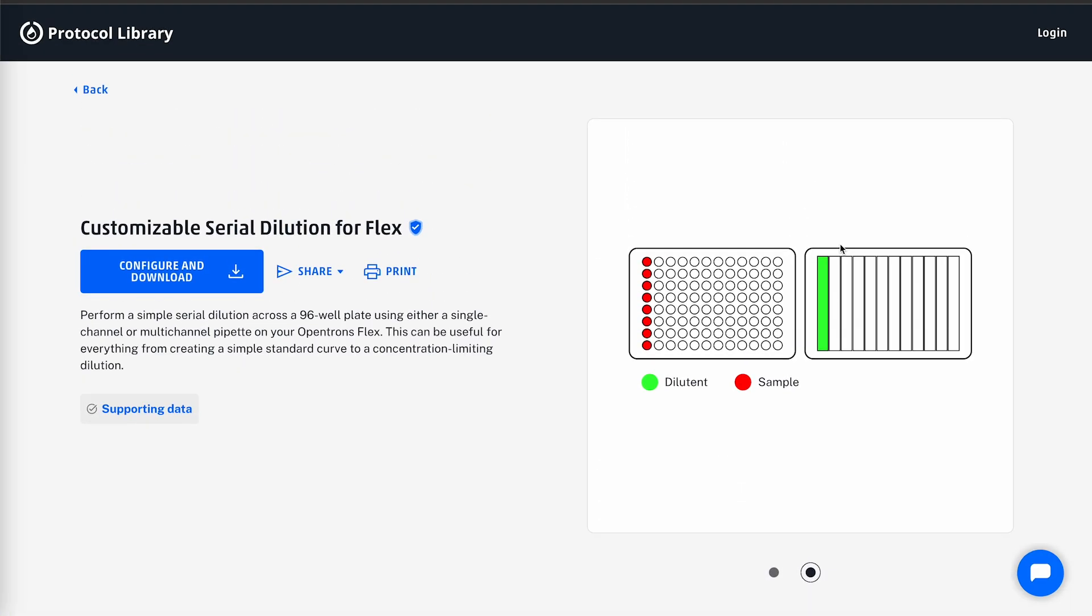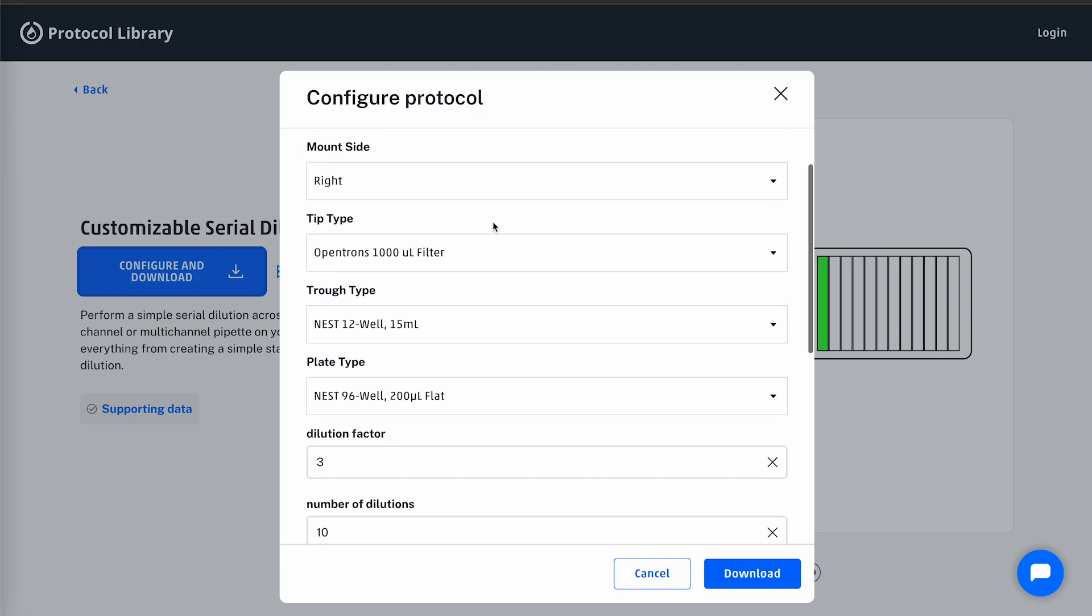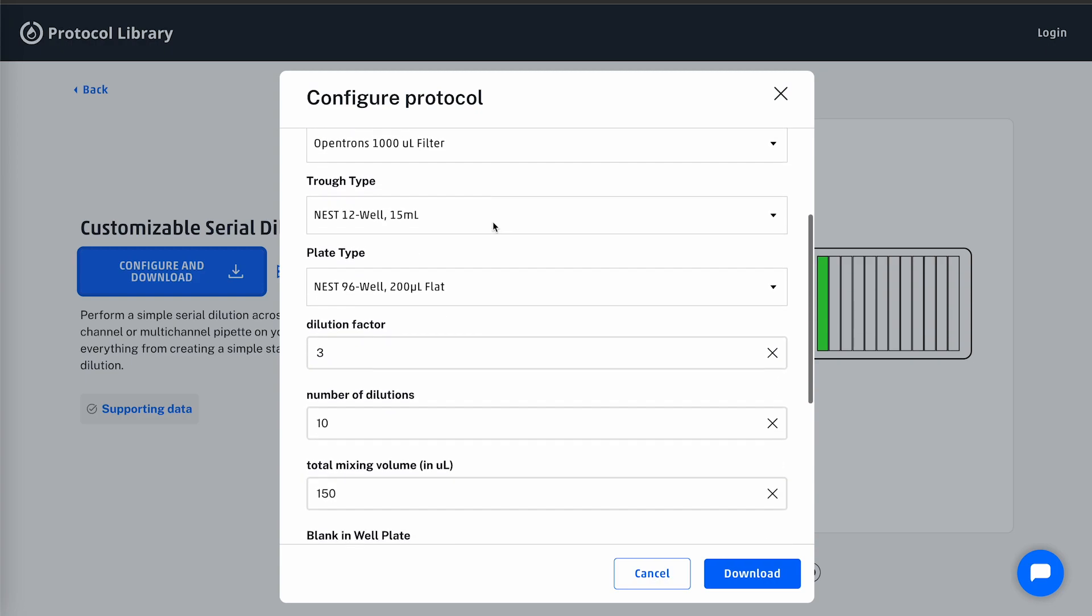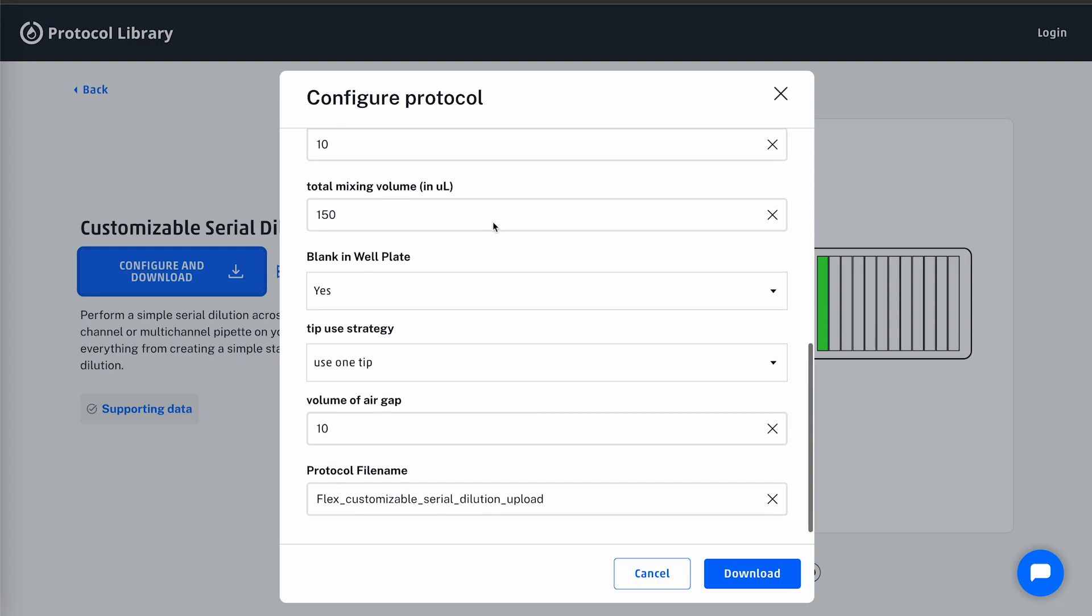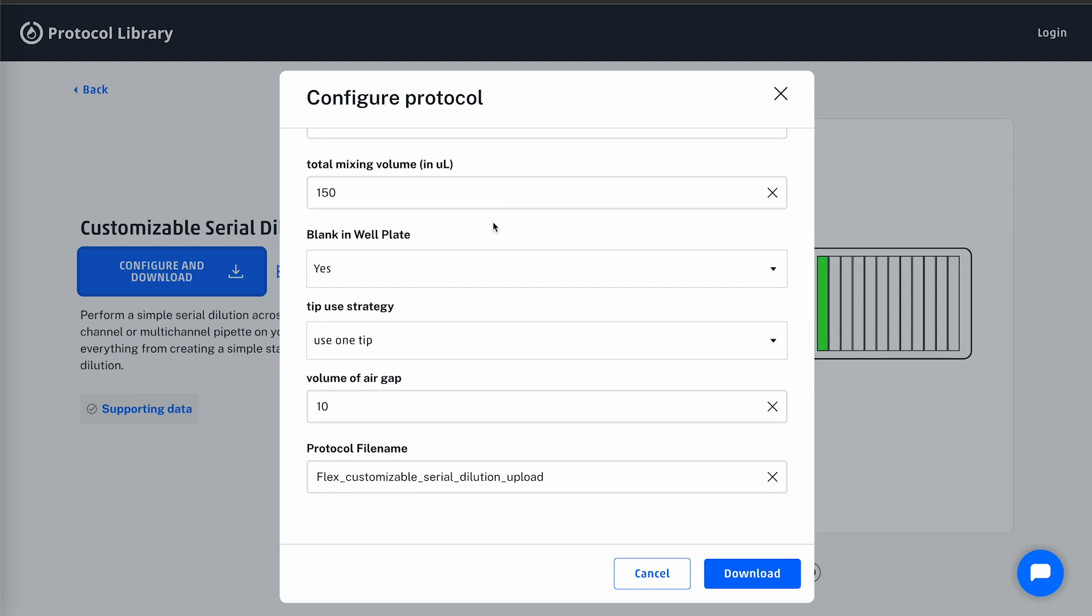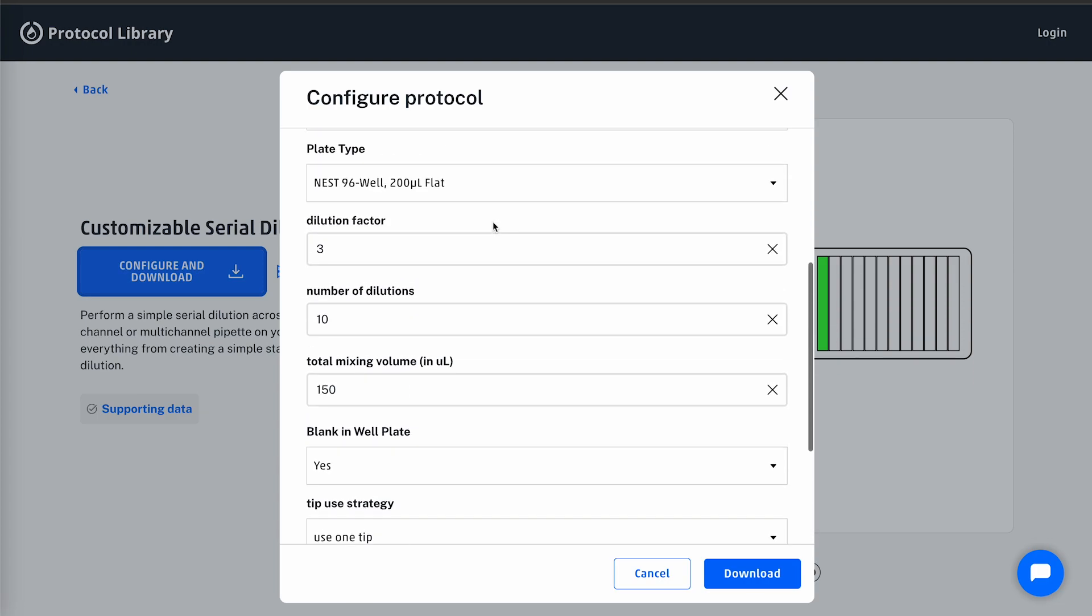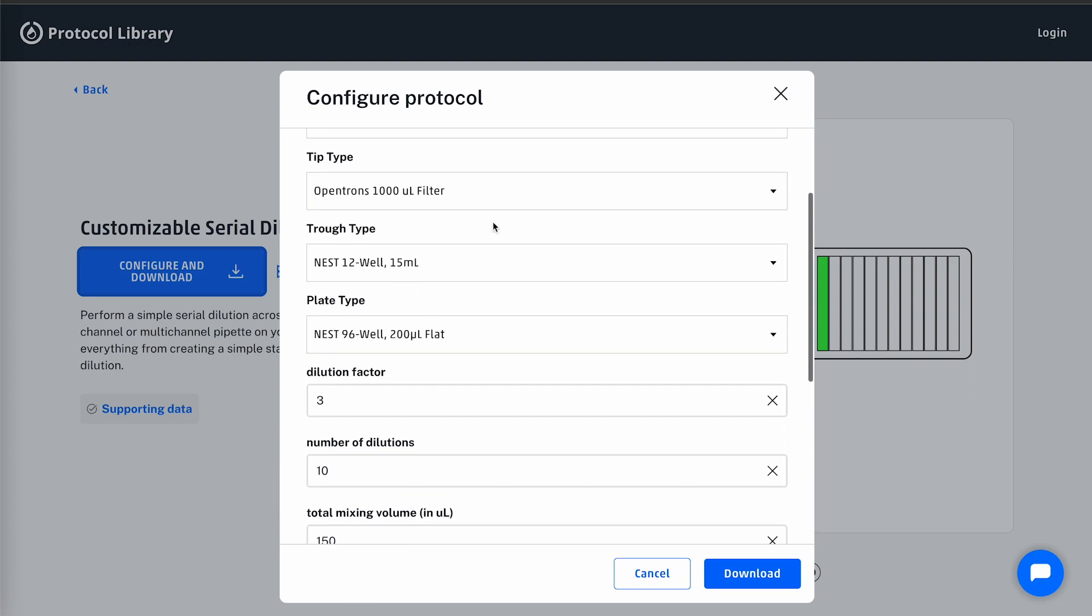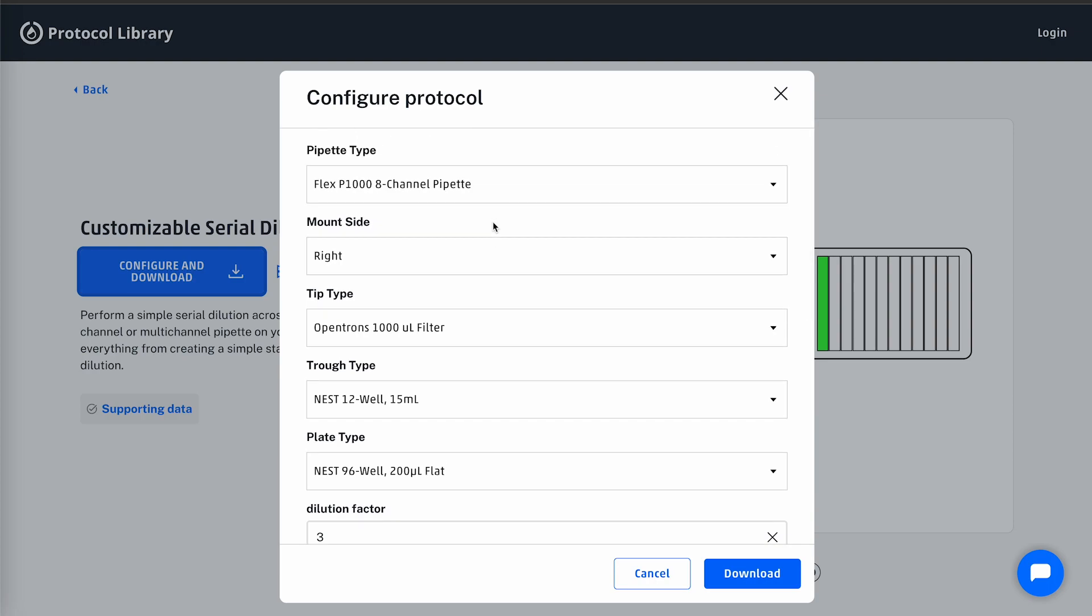Now I can use the configure and download button to modify specific variables for this protocol, such as pipette type, labware type, number of transfers, or different attributes about the transfer steps. My P1000 8-channel pipette is on the left mount of my Flex, so I will modify the mount side variable so the pipette is on the left mount.